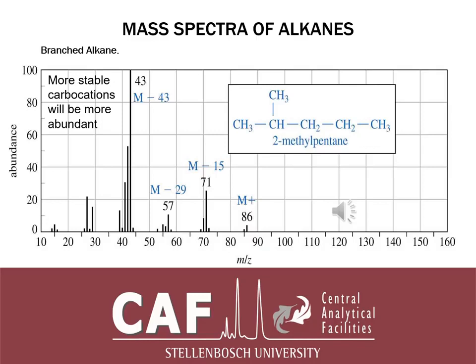If we come back to that positive ion, the positive ion can move from the CH, where it's not stable, to the CH3. When it goes to the CH3, it will be CH3 plus, and then you can have a double bond forming maybe in the second CH3, and then that will be stable, and you can also move around to another CH3. That's why they call it a carbocation. There's more than one place where it can be stabilized.